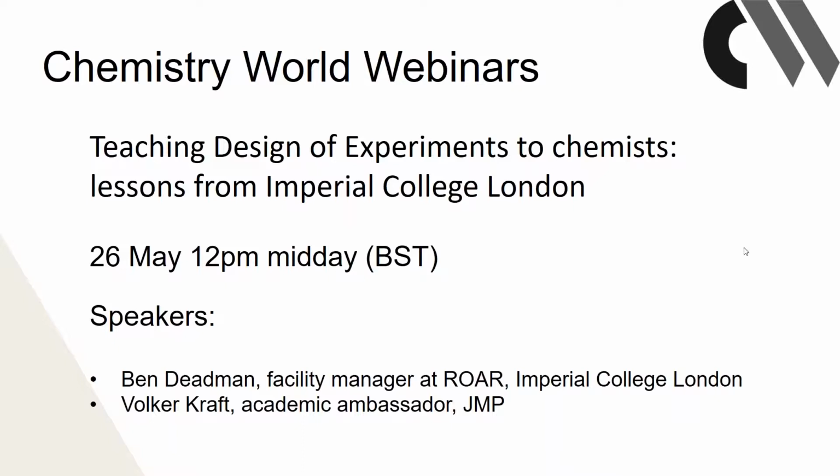So there's really a lot of functionality there. And I'd say, from a synthetic chemist perspective, it's not always the greatest tool when you're trying to optimize categorical variables. We're working on that, and I wouldn't say completely rule it out. You just have to understand that it's more difficult to draw those complex relationships between multiple categorical variables. Do you want to say anything, Volker?